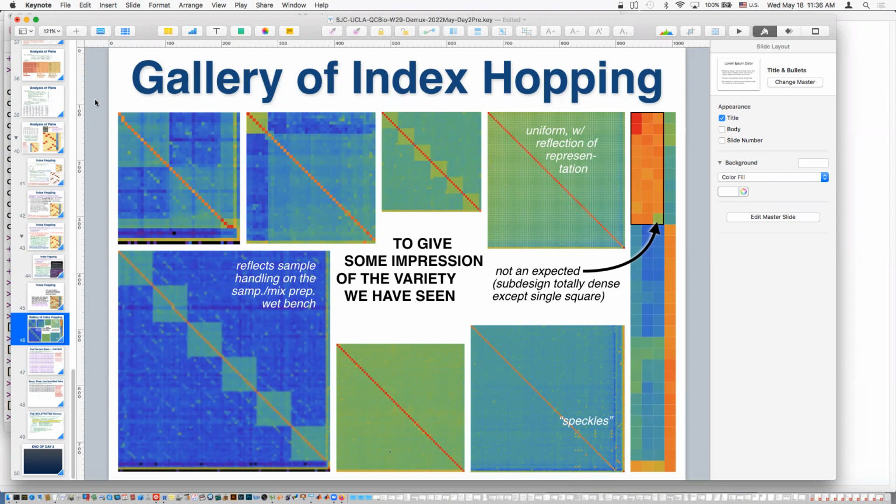This is a unique dual. This diagonal, I've carefully clustered here so that the rows and columns are consistent in terms of unique dual. This is still permuted, but it's permuted row and column simultaneously, so that you don't lose the one-to-one nature of the design. So the diagonal stays on the diagonal. Otherwise, the diagonal disperses into little dots everywhere. For unique duals, if you're going to cluster this, you should really cluster the rows and columns the same way.